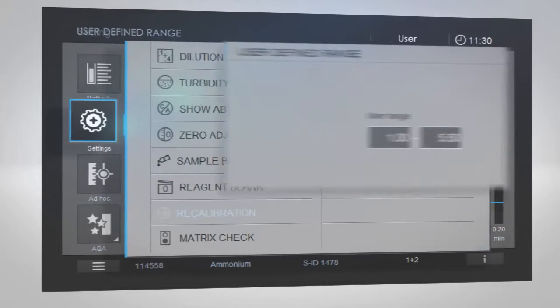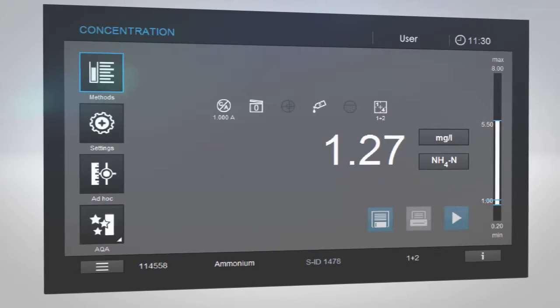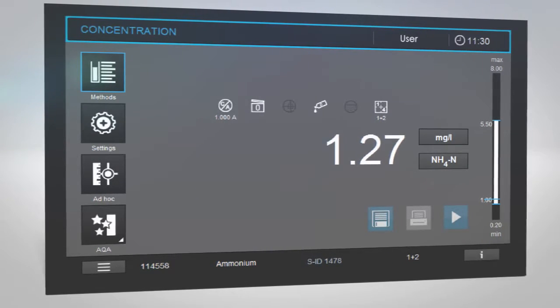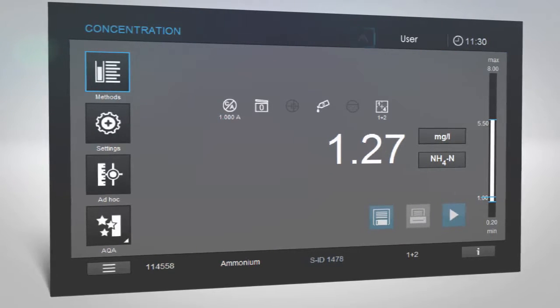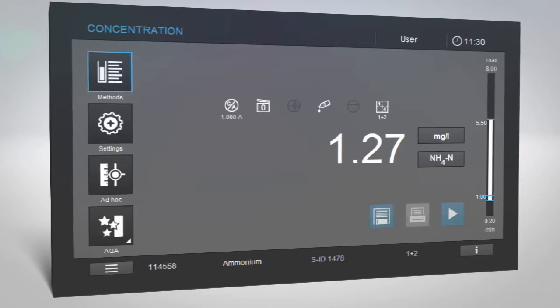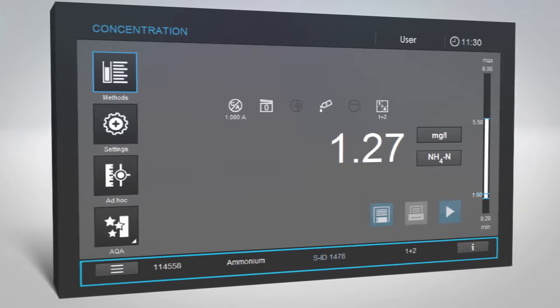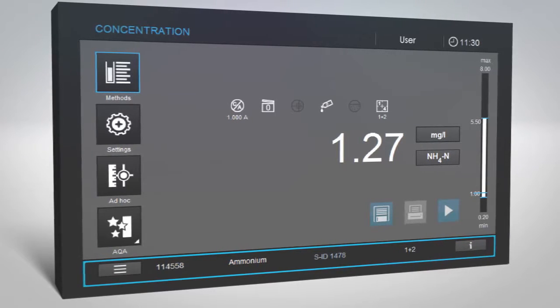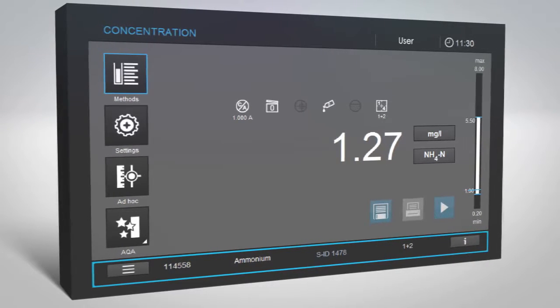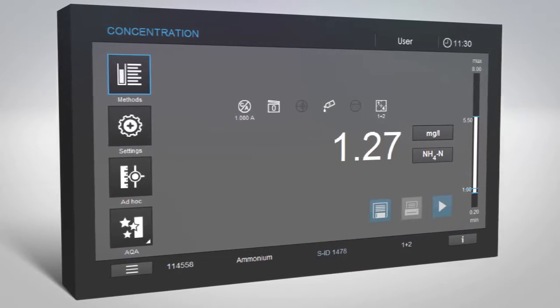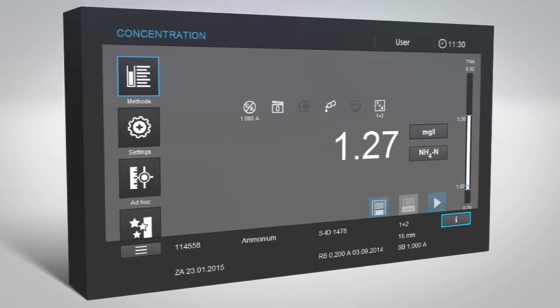The user-defined range is shown in white within the preset measuring range. The toolbar at the top of the screen displays the name of the function currently selected. If a hazard symbol appears in this bar, tap the symbol to see the alert. You will be warned if something is wrong with the system. The bar on the bottom of the screen displays brief information about the test kit currently in use, including its catalog number, parameter, sample ID, and dilution factor. For further information, such as cell type and size, tap the Information button.